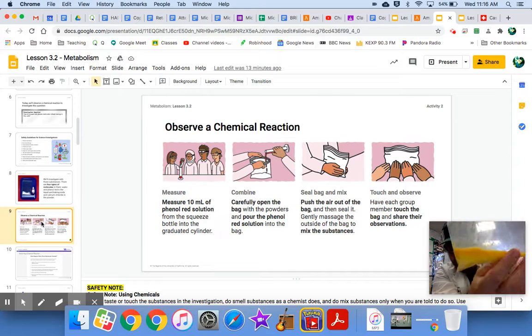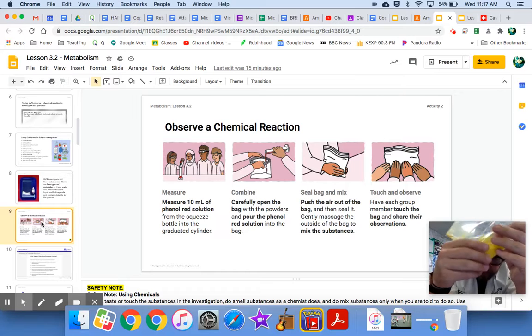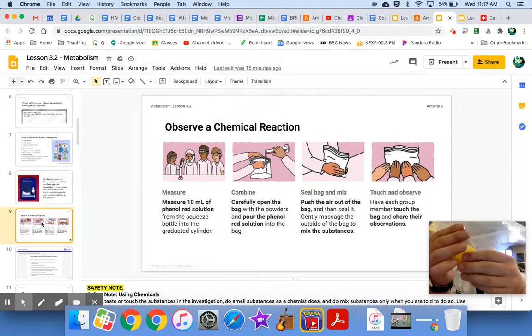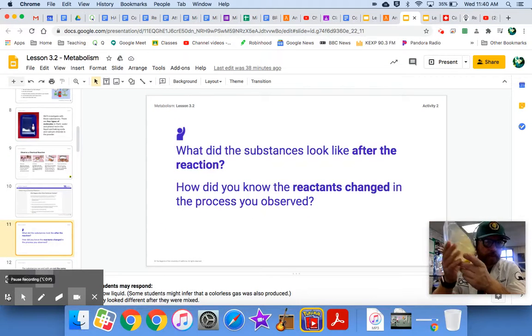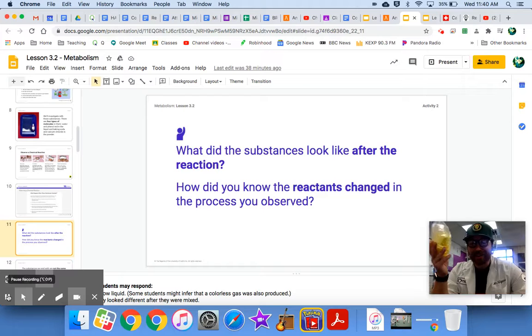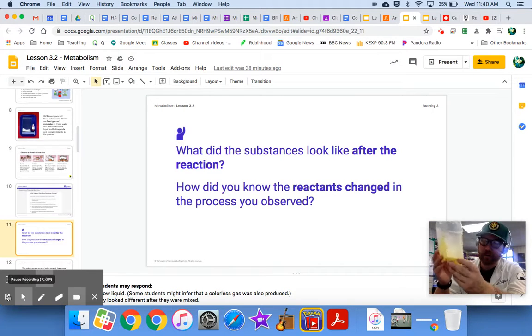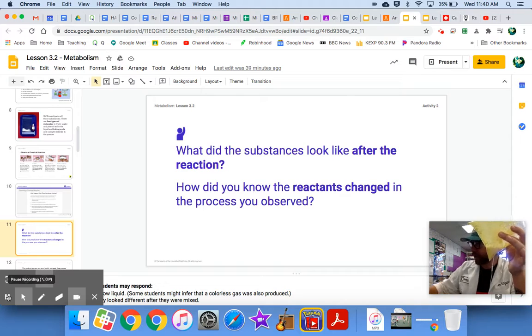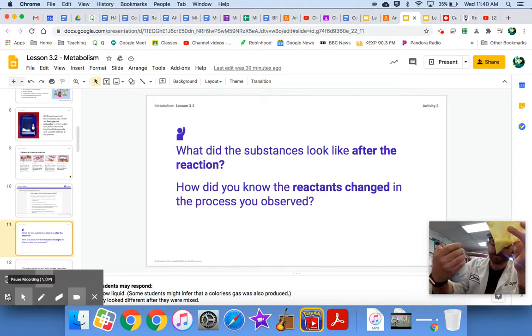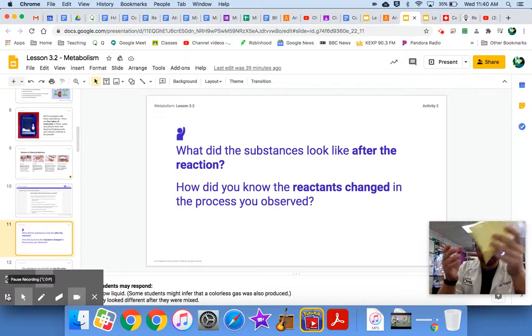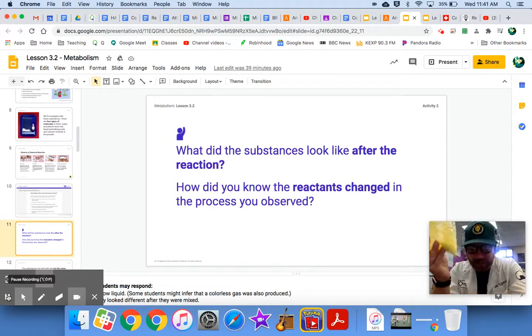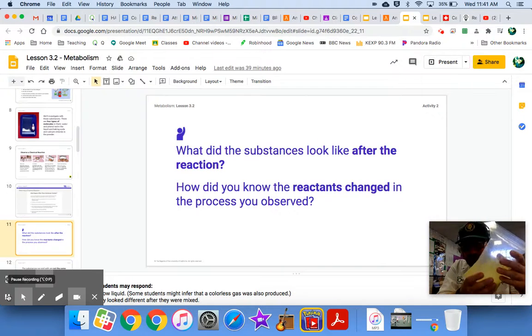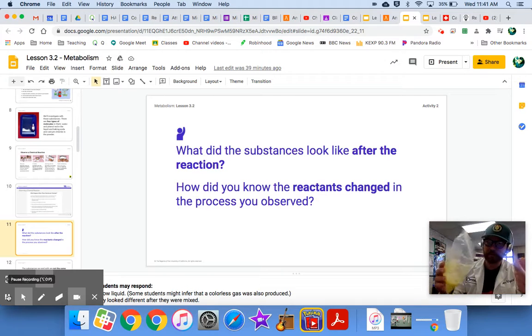Whoa. What do you notice right away? Right away we see something going on here. Make some observations there. Mr. Wiggin, that looks more like a vigorous massage. Not a gentle. I know. That's okay. One thing that I noticed about this bag is it got really cold. It felt cold to the touch. After a little while. We noticed that it's definitely changed color too. That phenyl red was a nice red color. The baking soda and the calcium chloride, those were white, white powdery color. So now we have this new yellow color that's going on here.